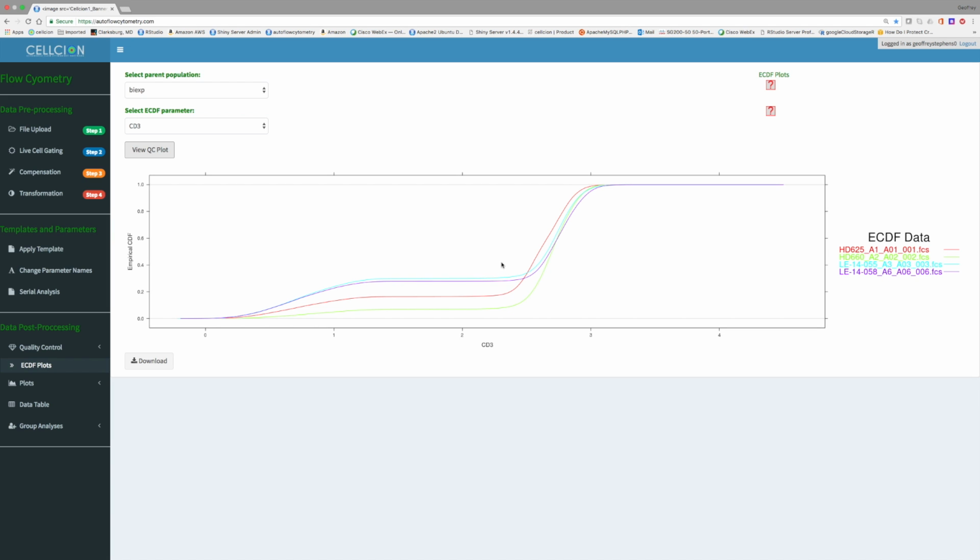You can see depending on where you are in the region, the lines may be a bit different. One thing to bear in mind is this could be a real difference. It may be a sample-to-sample variation, but because we have a couple of lupus patients that look like they're off, that's something to keep in mind. Those are our LE samples. So this could be real, but it's just something to consider as you go forward.